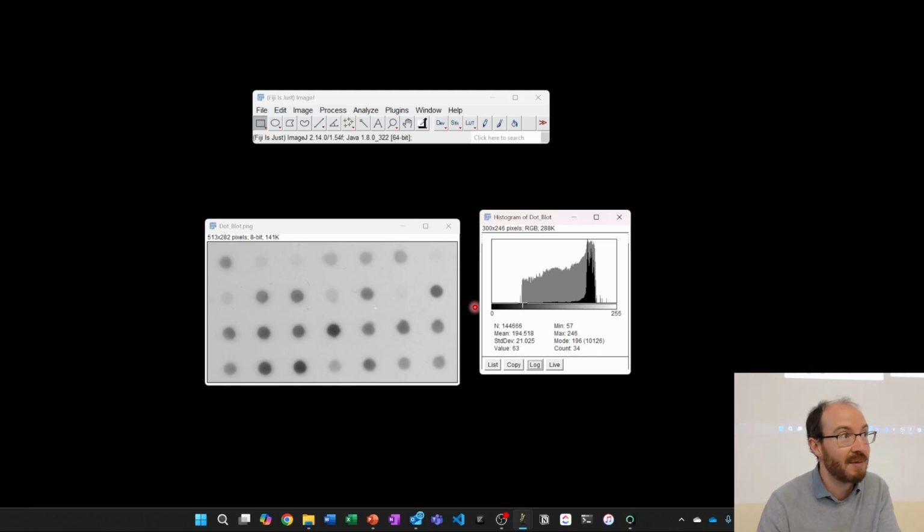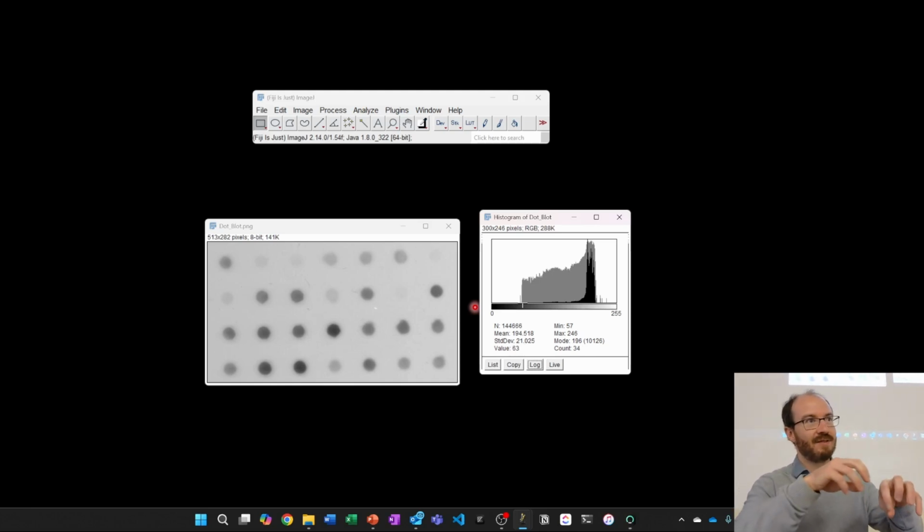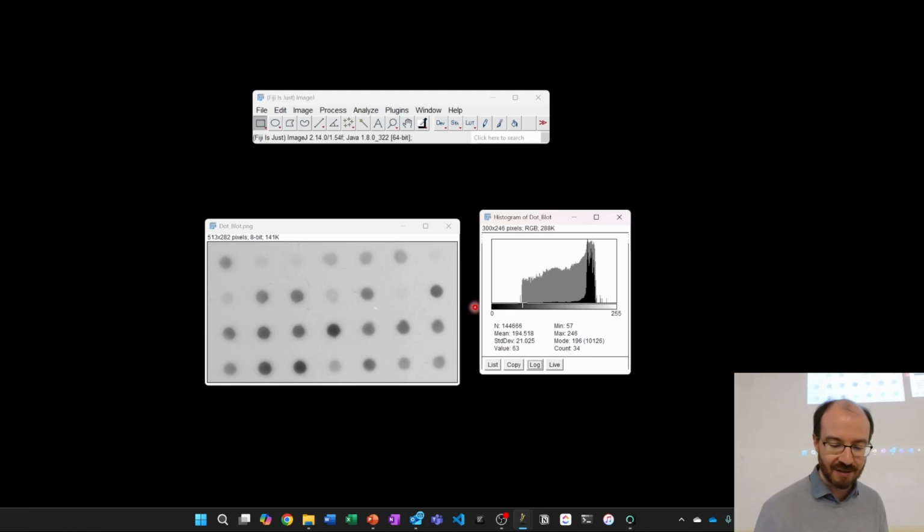For many microscopy images, what you'll see is actually just the inverse. The majority of the image is black, and then you've got very small structures on this, and if you look at the histogram, it looks like everything is on the low end, there's nothing on the higher ends. And you say, hey, I can just cut out all of these high values, I can stretch my contrast and everything in my histogram because there's nothing there. And if you just click on this log button, you see, oh wait, there is actually some information there.